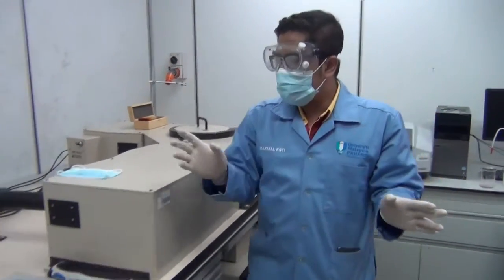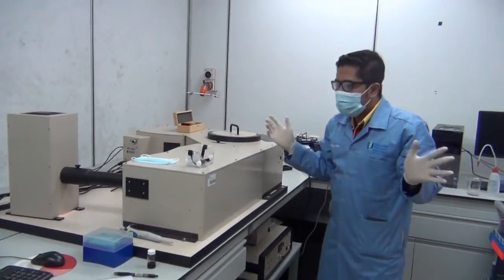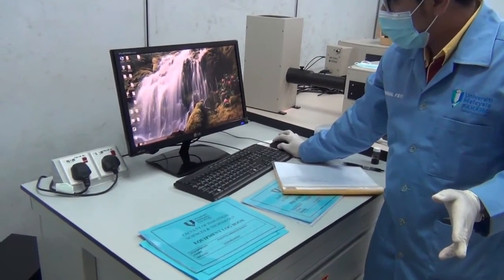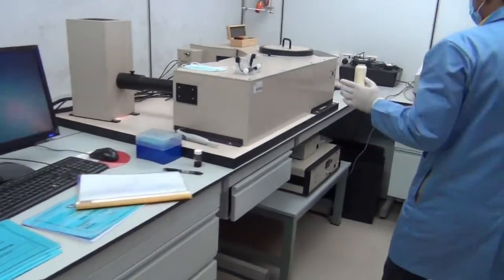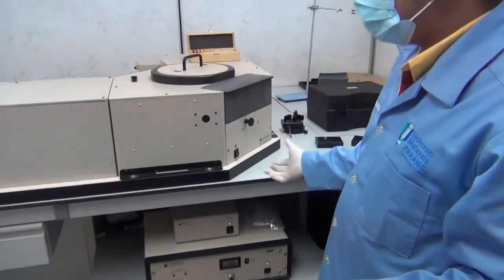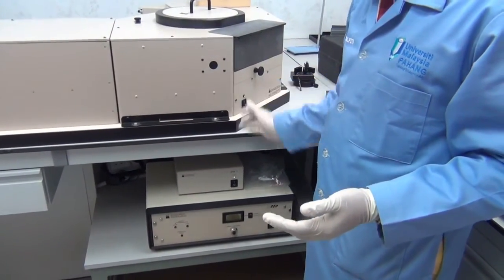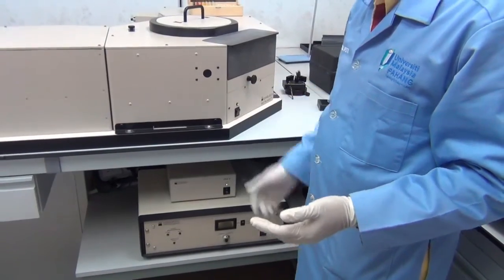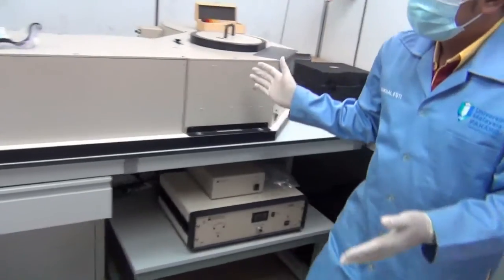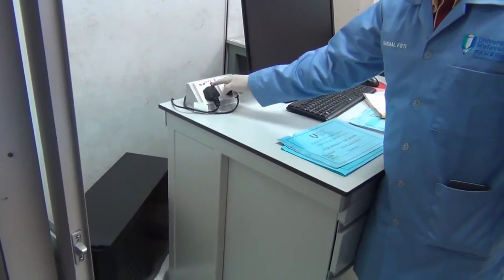What else? You need to switch off the machine. How to switch off the machine? Very easy, not complicated. Switch off the computer first. Shut down. Then go to the machine. How many switches have we switched on? Around 6. 1, 2, 3, 4, 5, 6. Switch off any switch. No specific sequence. You could switch off this switch first, followed by this. No specific sequence. And then again switch off this main switch.